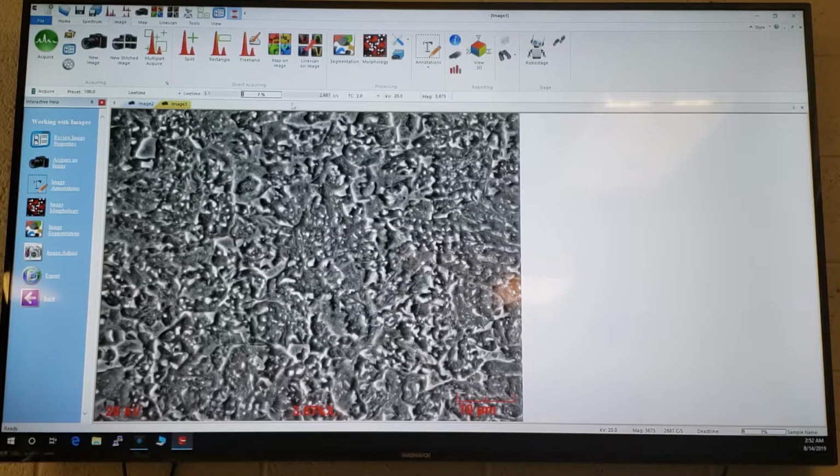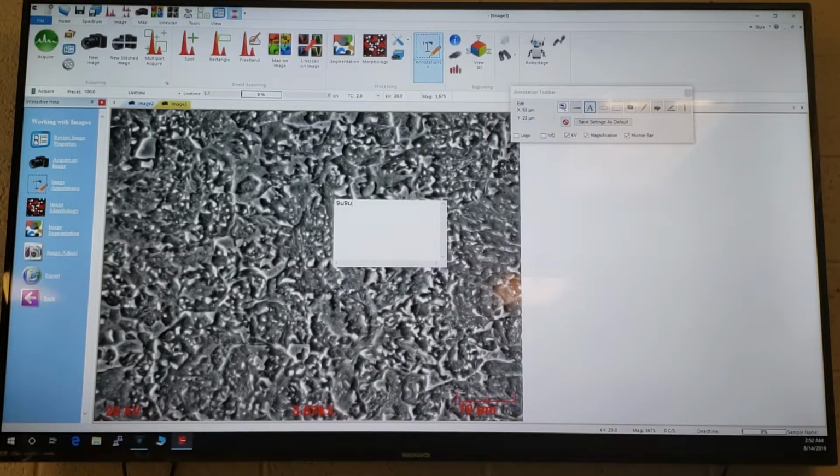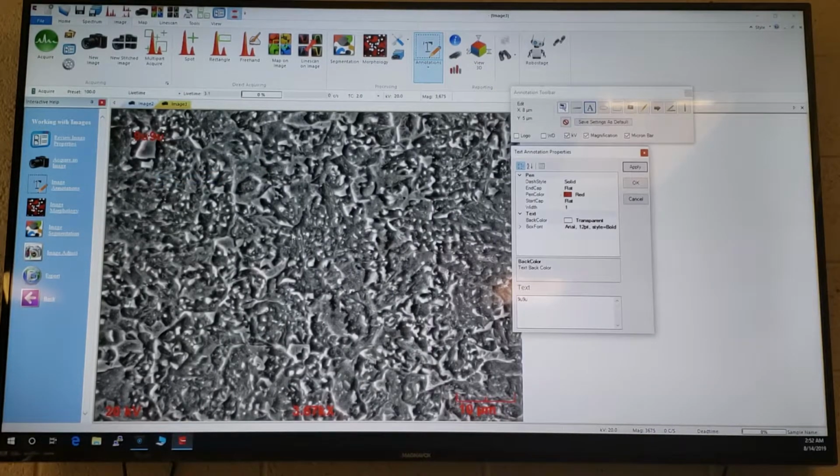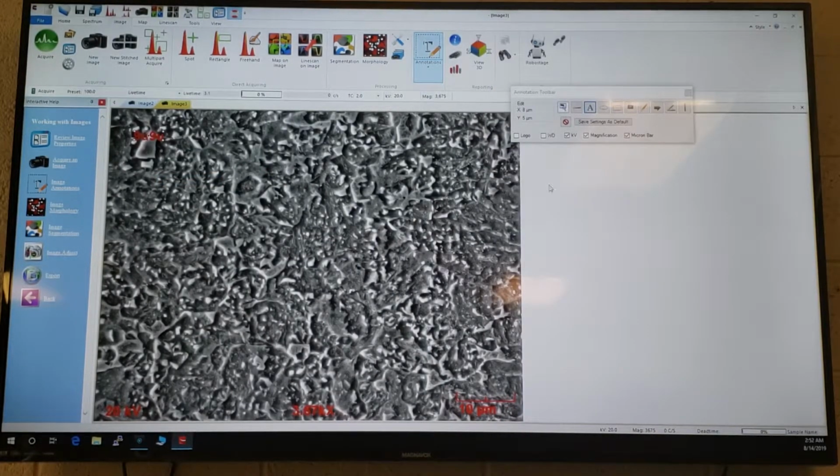So okay, after the image comes in, and if we start following the flow chart, I'm just going to kill the SEM beam again. As the image comes in, start following the flow chart, we have image annotation. So in here, we can actually annotate the image, move that around to where we want it to be, right-click on it, change its colors just like before, just like with the Spectra window.